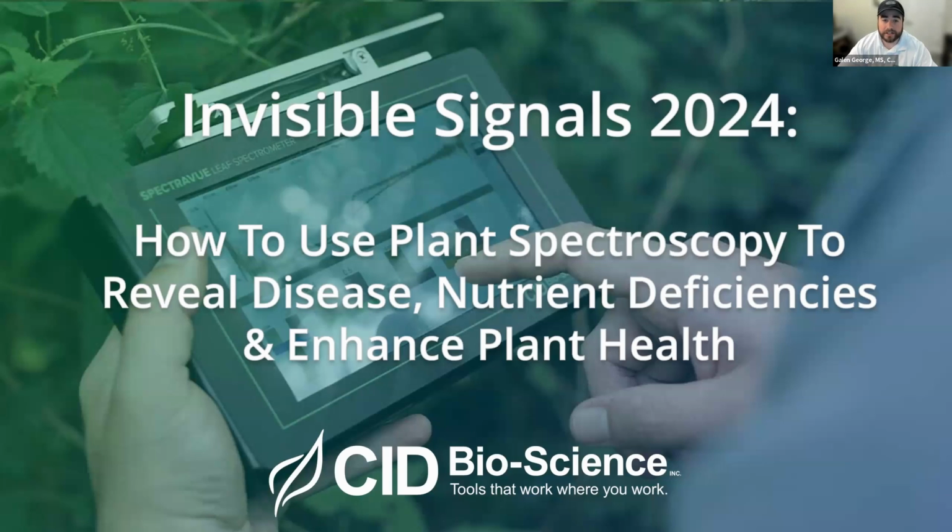Today, we're going to be talking to you about plant spectroscopy, specifically the uses, the applications, the types of devices that you might encounter, and diving in a little bit more specifically about our CI-710s Spectravue Leaf Spectrometer.